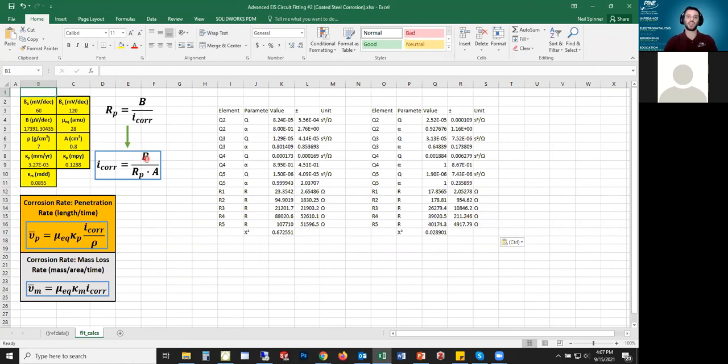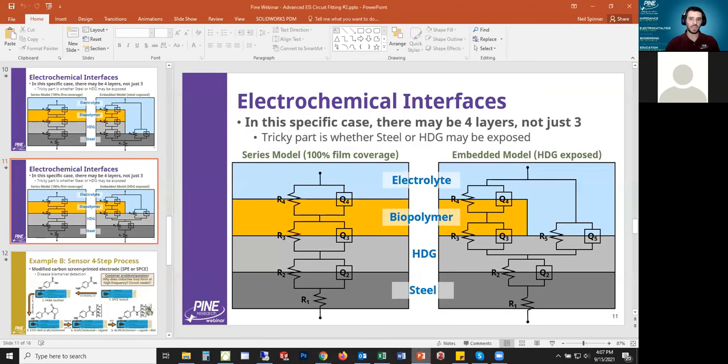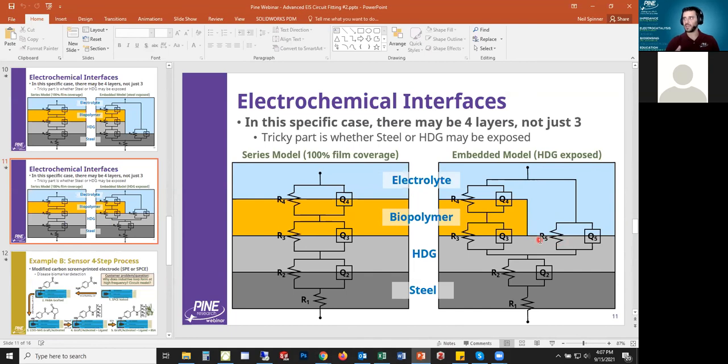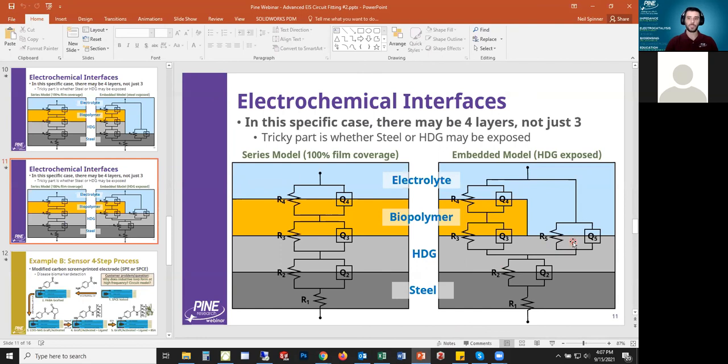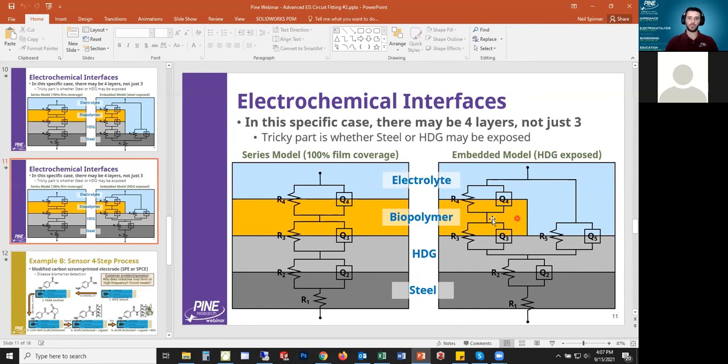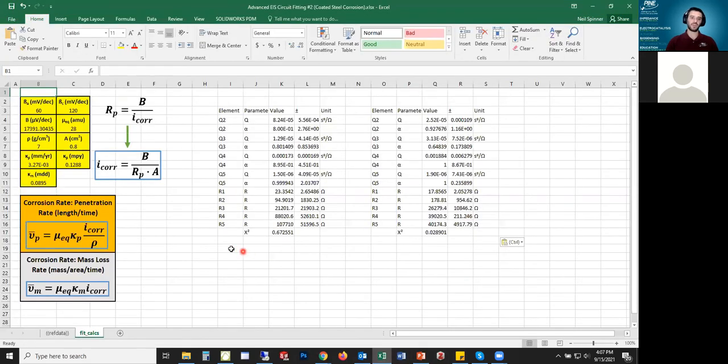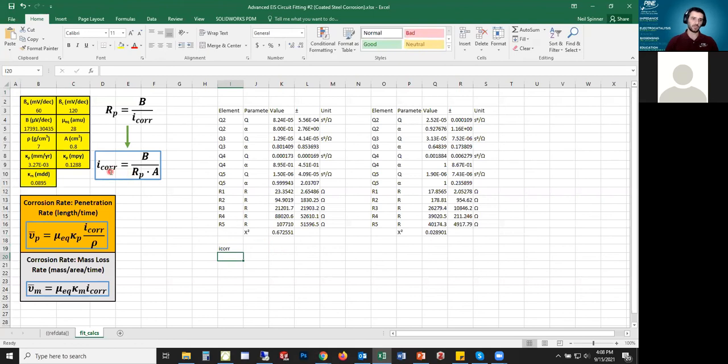Basically, there's two common ways or units that that's used for. One is called penetration rate, which is typically something like a length per time that you're corroding your material. And then the other is mass loss rate, which is something like a mass per time that the material is corroding. The question is which R should I use? I have five resistors. My opinion is I should probably use R5, because if what I've done circuit fit on is accurate, the biopolymer is protecting it, and the resistance to my electrolyte where it's corroding, this R5 seems the most likely resistor to be related to the corrosion rate.